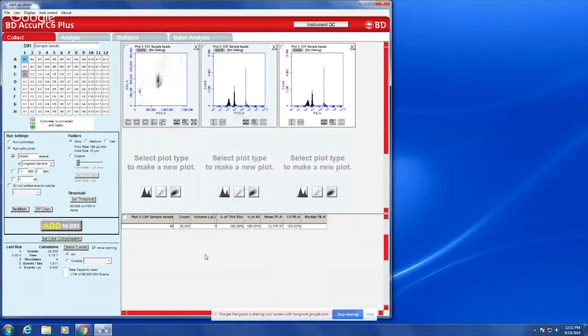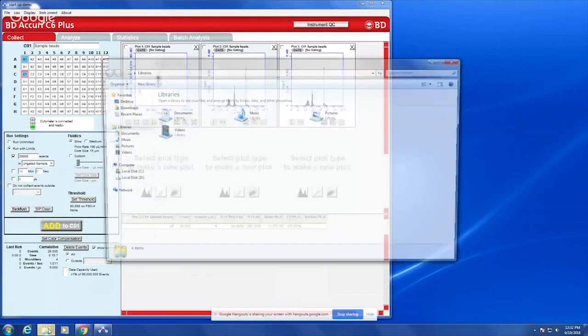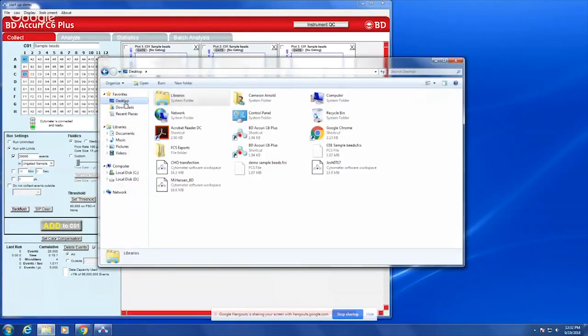At a bare minimum, be sure to save your data in the workspace and be careful not to overwrite your data if you use the same workspace at a later time.